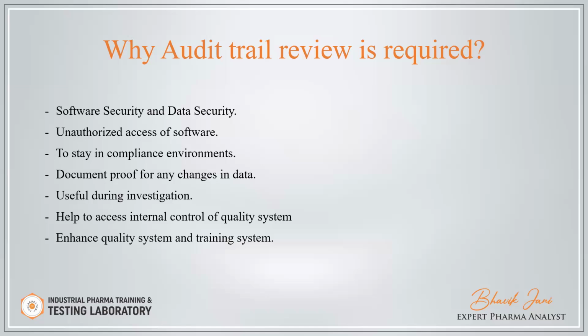So by the audit trail review, we will be in a compliant environment. And the most important thing about audit trail review is that we can assess our internal control. After assessing the internal control, we can enhance our quality system and the training system. We can provide training to the user if any abnormality is there.